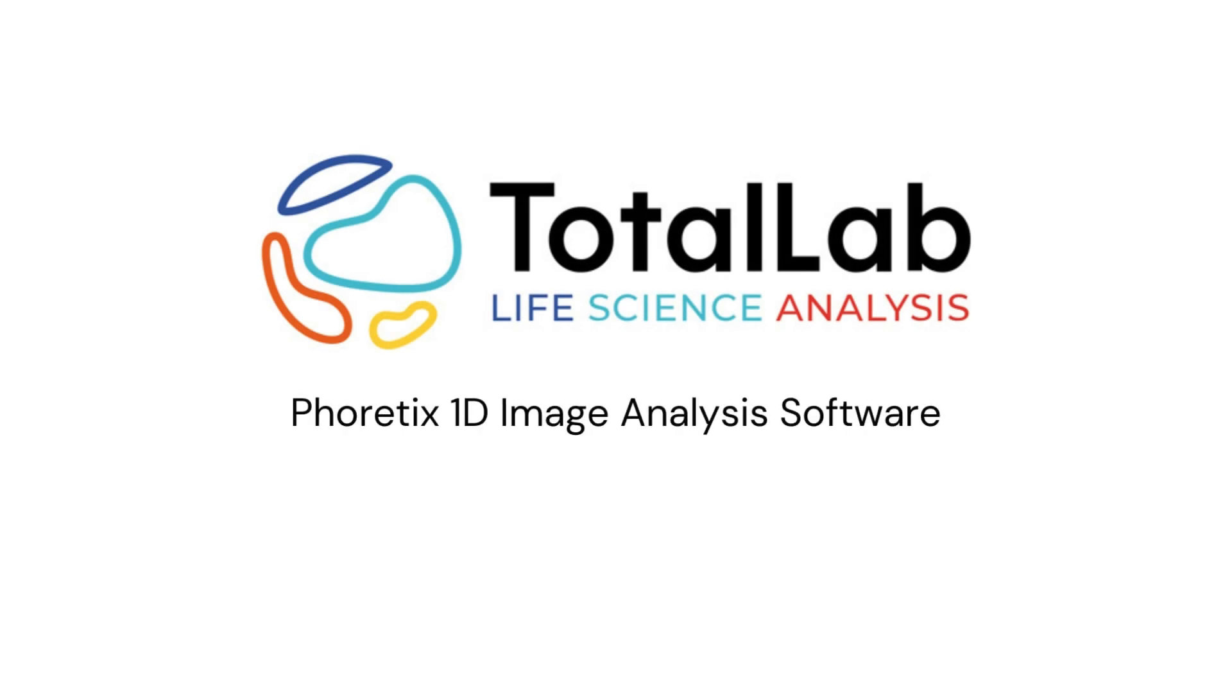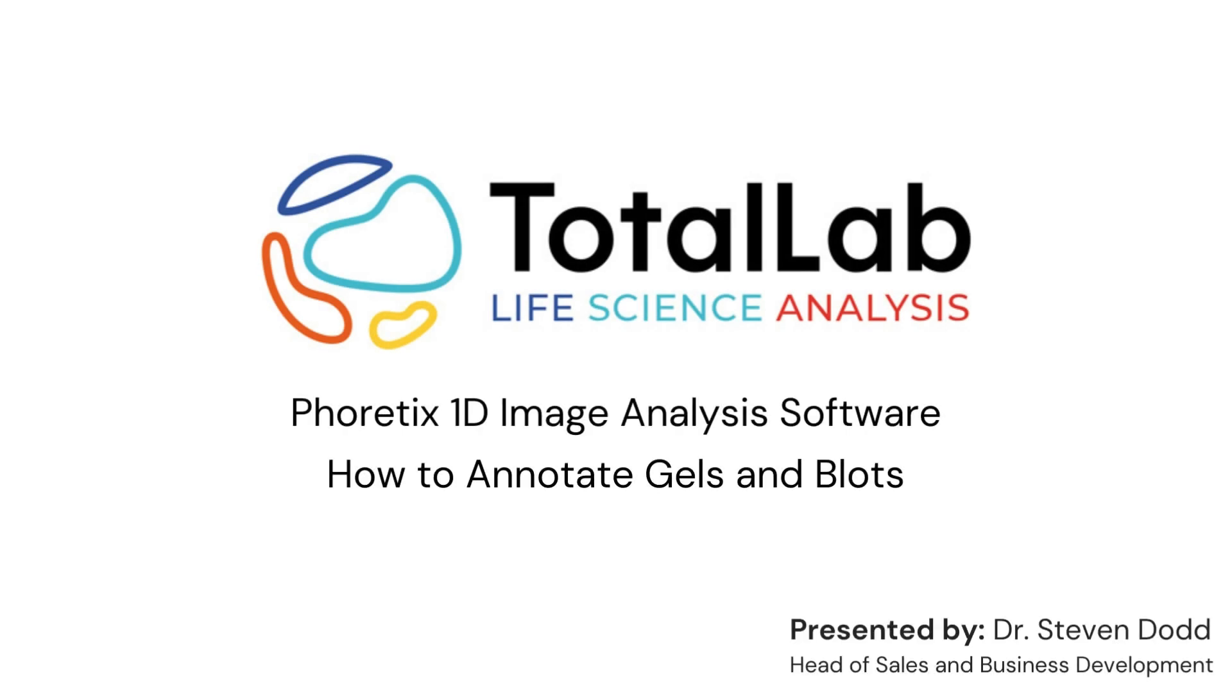Hello everyone, so today I'm going to be showing you how you can use the new annotation function built into Phoretix 1D image analysis software to annotate your gel and blot images.